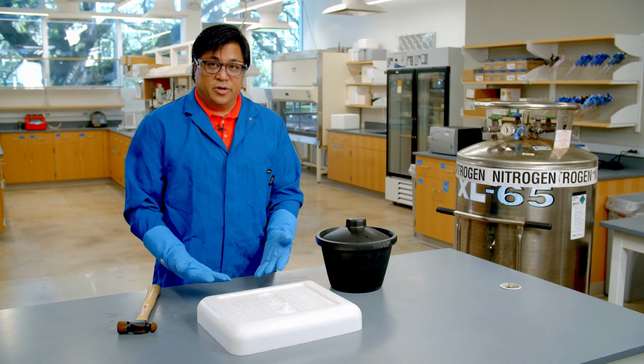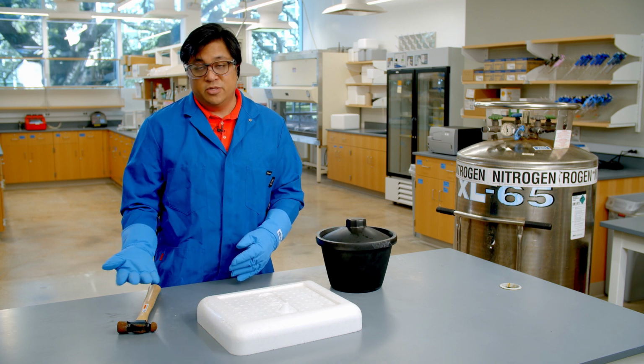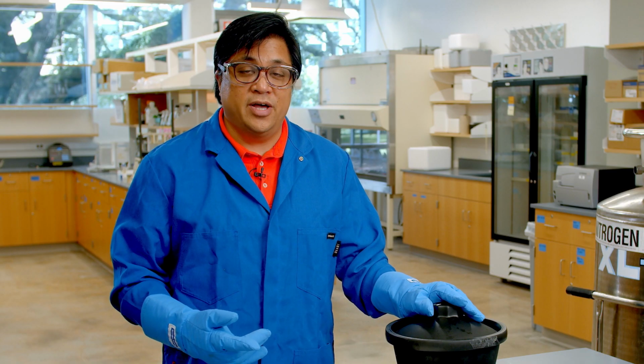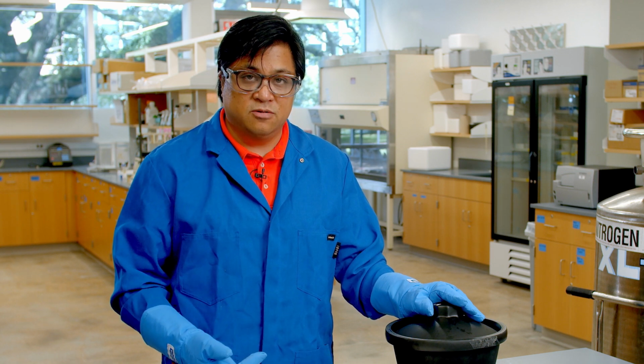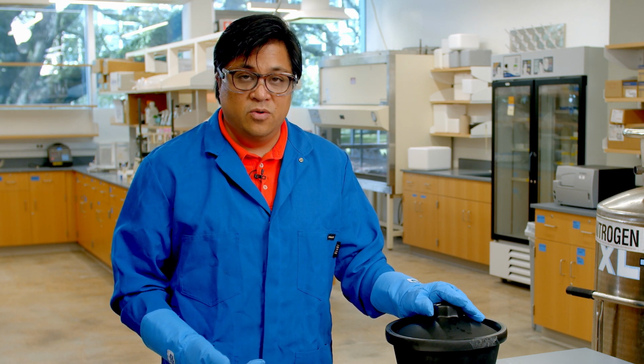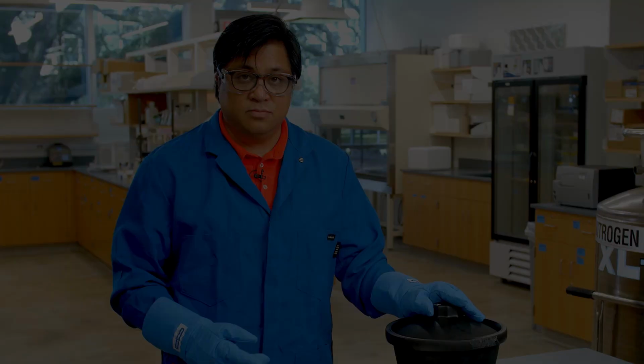At the completion of your work, you can store any excess dry ice inside of a fume hood or on your bench with the lid closed. Do not put dry ice in the sink or any waste receptacle, including chemical, biological, or broken glass container. And remember, do not store dry ice in a sealed container.